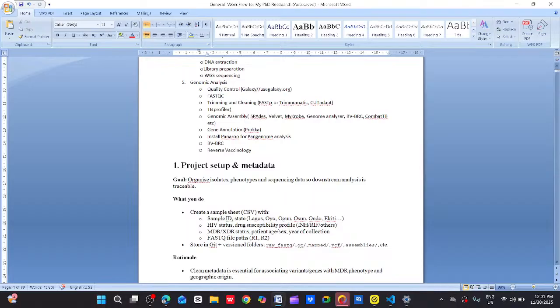Really, I don't know much about this Ubuntu, but I know that it is one of the tools that creates the environment for how Panaroo is going to work. So Conda was installed, and Panaroo was also successfully installed. The next thing is to make sure that we continue from our success of Panaroo installation.